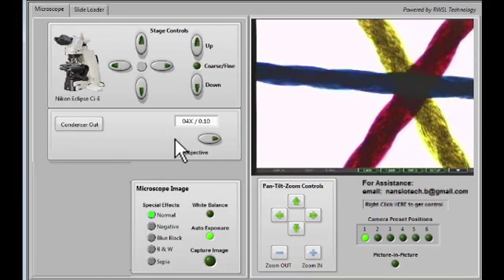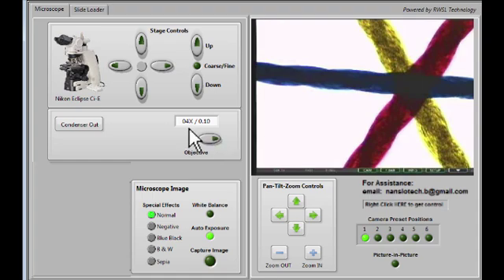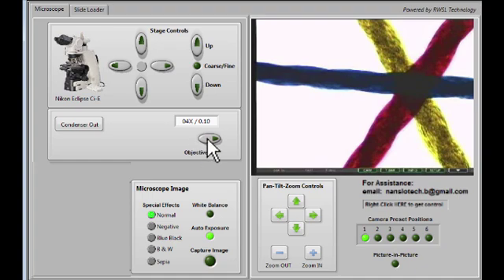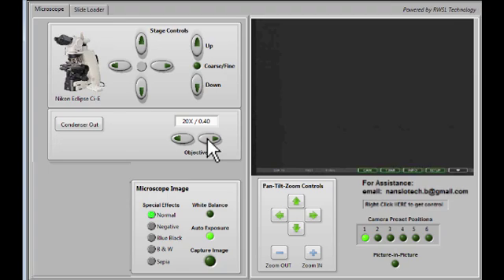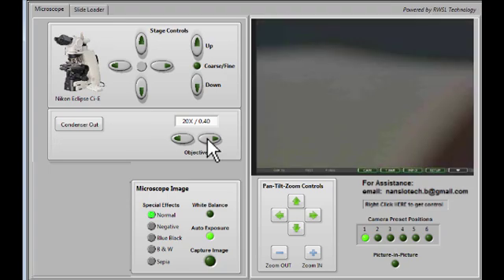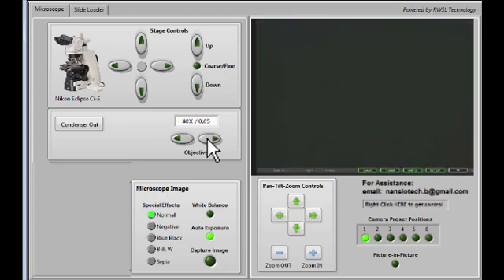In this part of the control panel, we can change the objective. Currently, we're using a 4x objective, giving us 40 times magnification. We can change that to a 10x, 20x, 40, and 60 for a maximum of 600 times magnification.